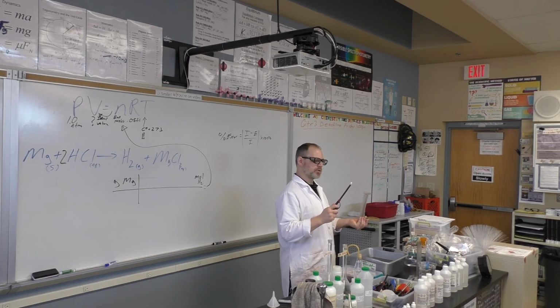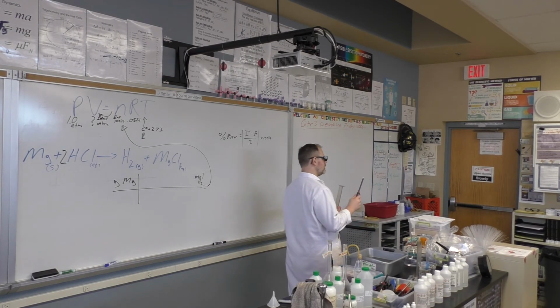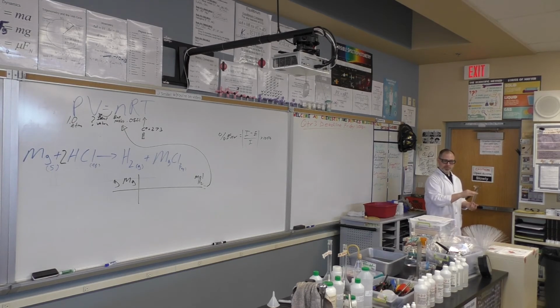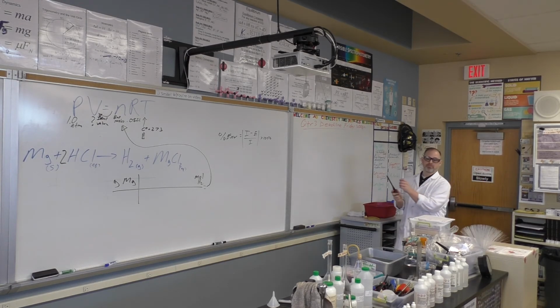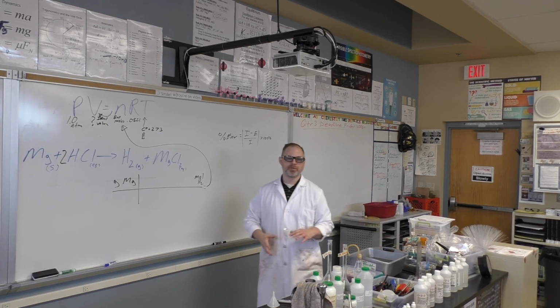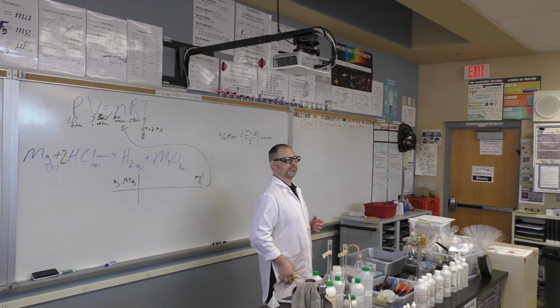Again, this part is totally optional. Then I'm going to bring my flame and my hydrogen gas over to the designated popping area. This is the designated popping area. No one's doing lab over here. You're going to get your flame, then you're going to invert your graduated cylinder to allow the hydrogen gas to escape into the flame. Sound like fun? All right, so get my flame first. Oh, that's cool. That's why it's called the pop lab. Some of you are going to get a puff, and some of you are going to get a pow! So, you know. Okay, questions?